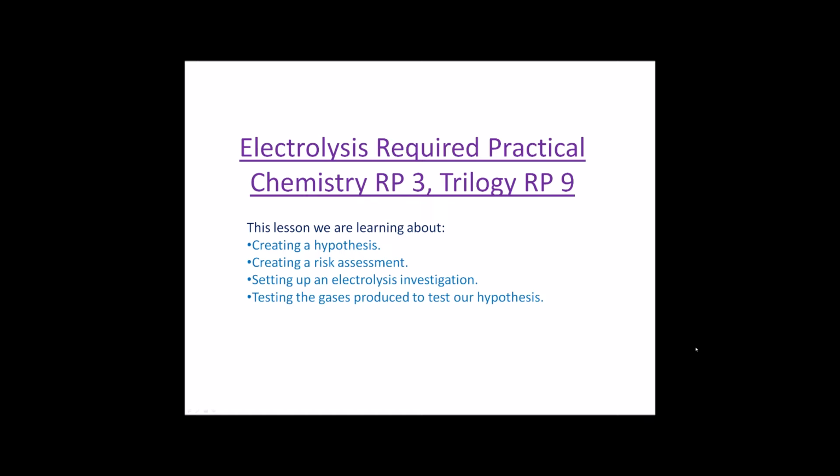And what we're learning about today is how to create a hypothesis, how to create a risk assessment, how to set up the electrolysis investigation, and how we test the gases to prove our hypothesis. And first step then is how to create a hypothesis.